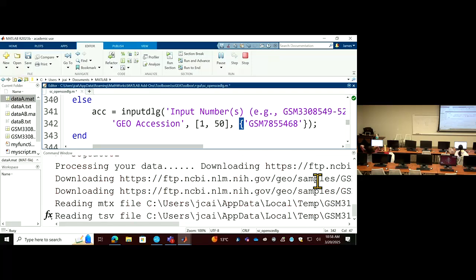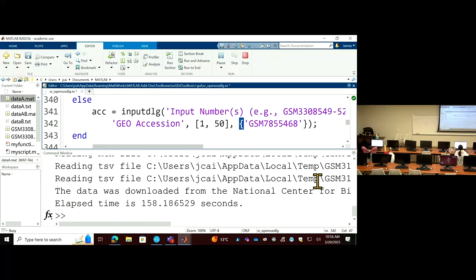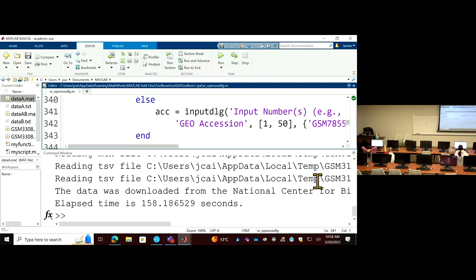Oh, so it's like when it calls this one. Oh, okay. This one, it's calling. Yeah. So that's what I'm going to do.